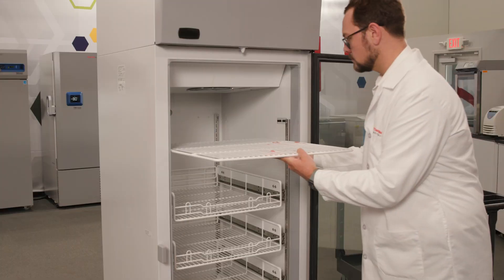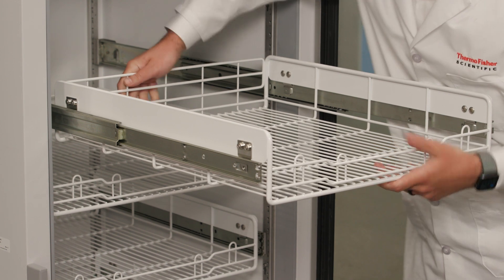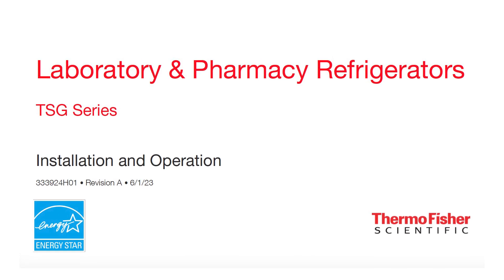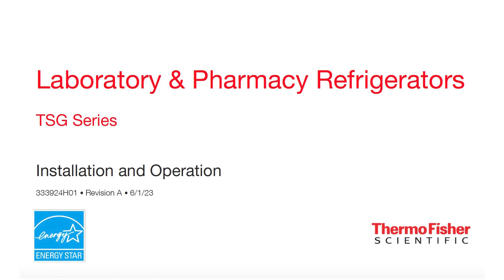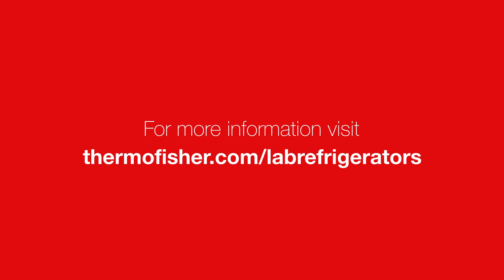Your TSG refrigerator is now ready for shelf installation and basket adjustments. Please view the Thermo Scientific TSG Refrigerator Shelf and Basket Installation video for more instructions. Refer to the Thermo Scientific TSG Refrigerators Installation and Operation Manual for more details. Enjoy your new Thermo Scientific TSG Refrigerator. Visit thermofisher.com/lab-refrigerators for more information.